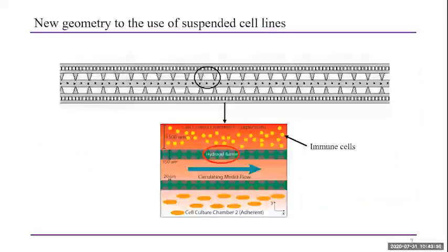First of all, tell me what COMSOL is. So COMSOL is an online software where you can generate an online device and run simulations. And so basically on COMSOL, I was working to build this new device in hopes that we could alleviate the problems that we saw arise.